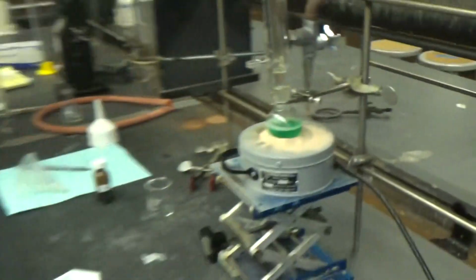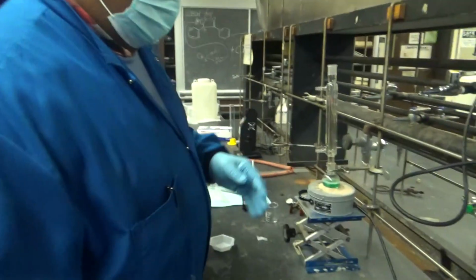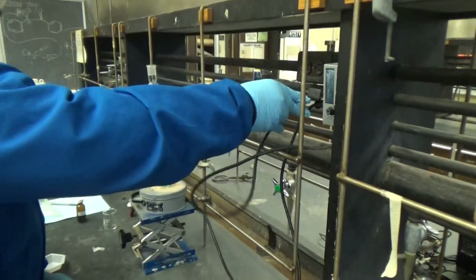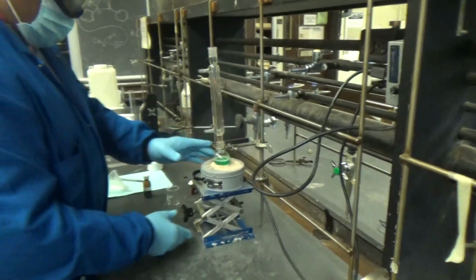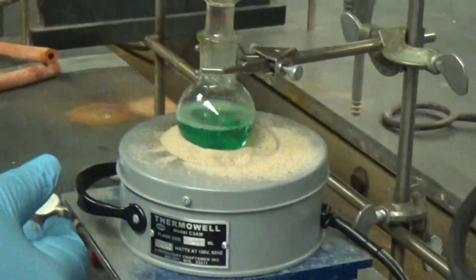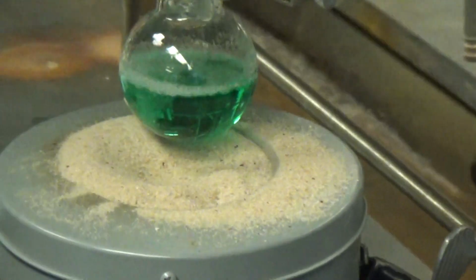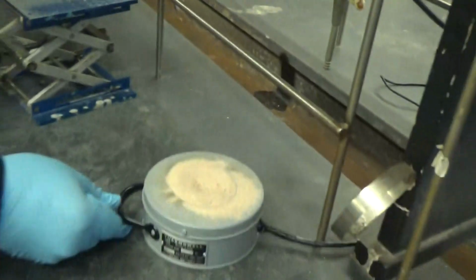So first thing we do, we stop that, as usual. Unplug the power. Now it's still pretty hot. So bring that down. I'm going to use that later.